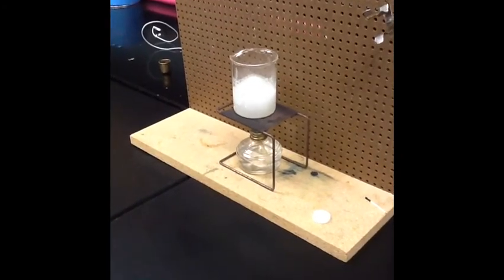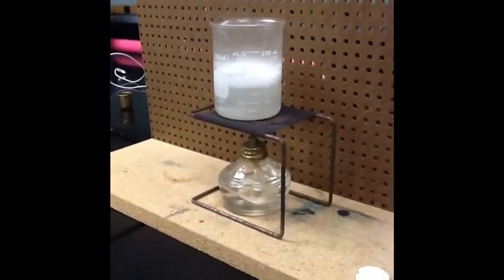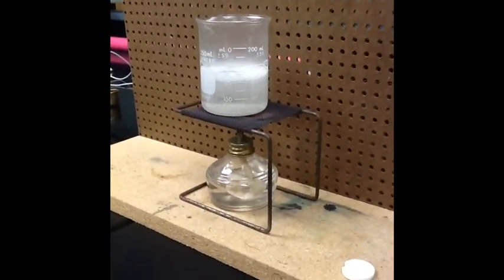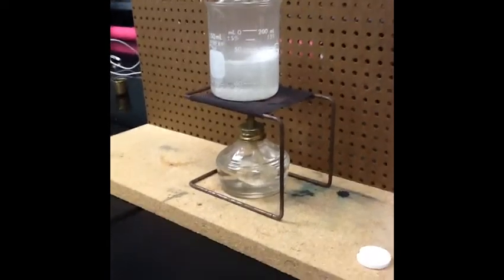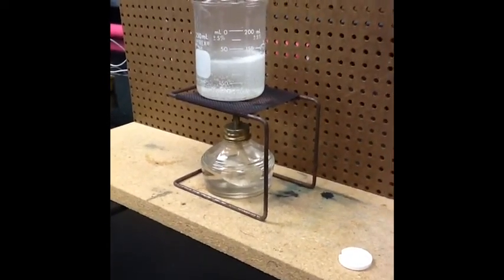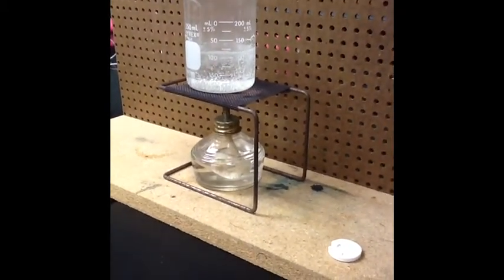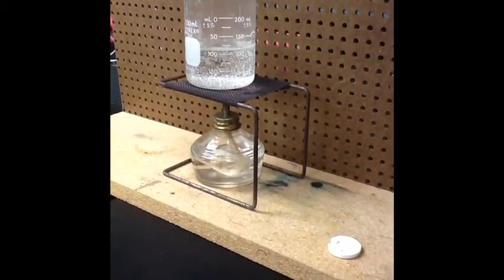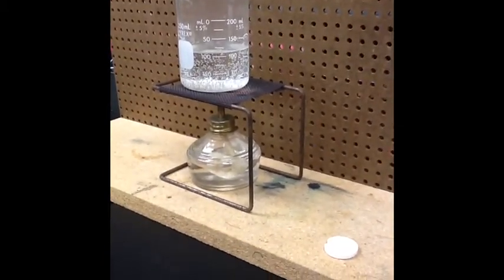Wow, that is a lot of bubbles — it's really bubbling. That bright white thing is the tablet, and it looks like there's lots of carbonic acid now in this water.